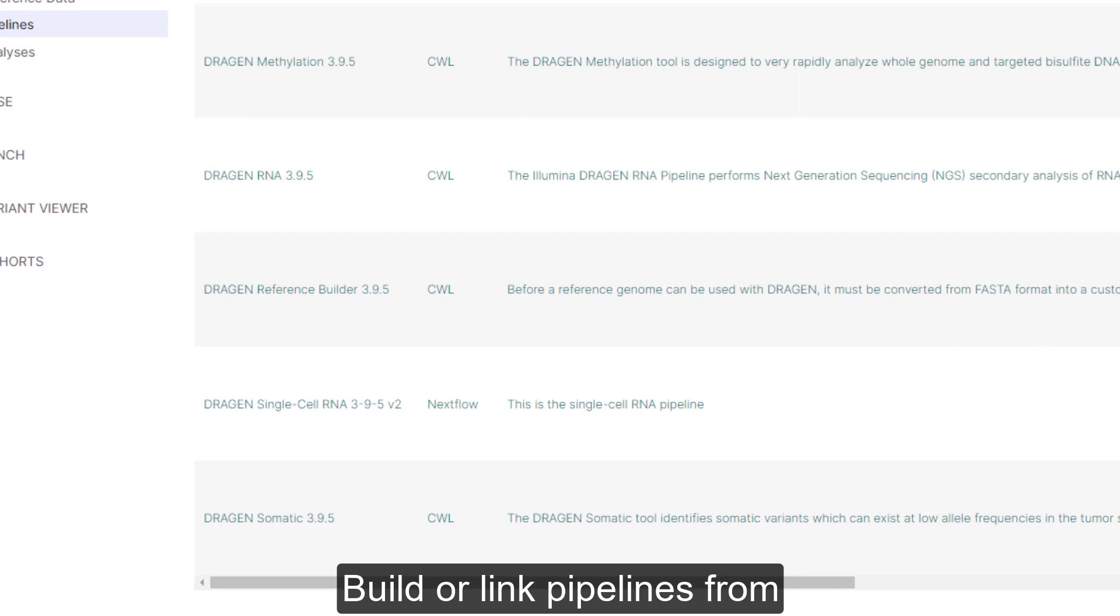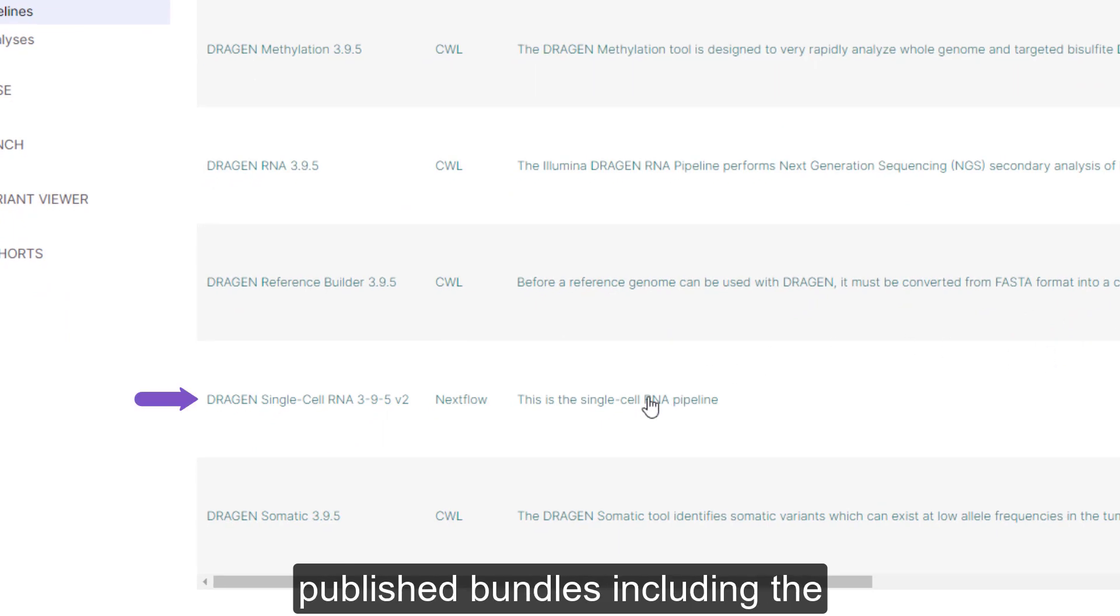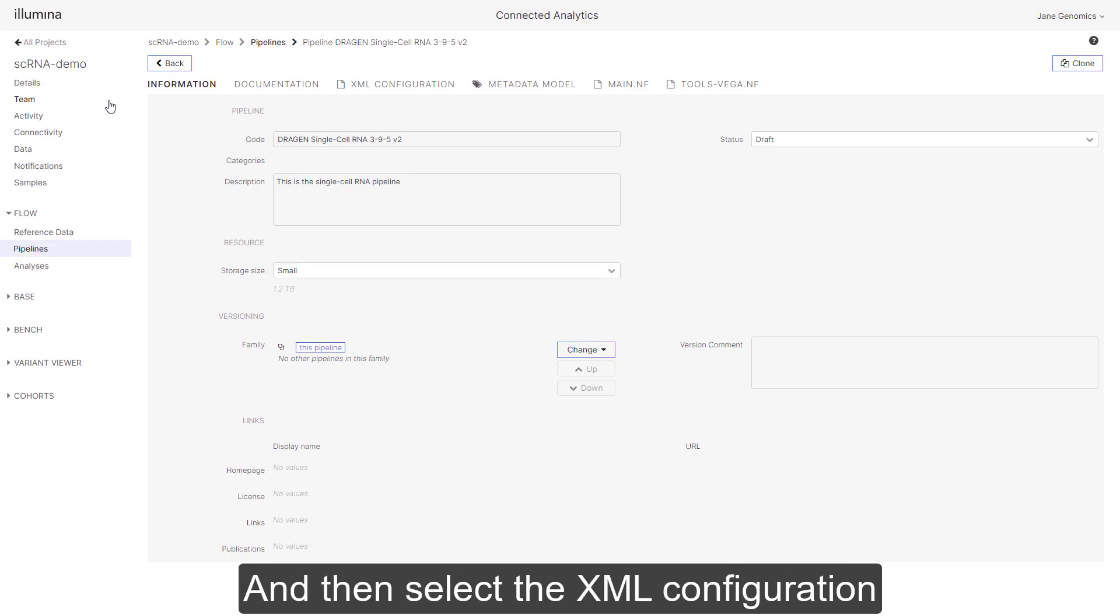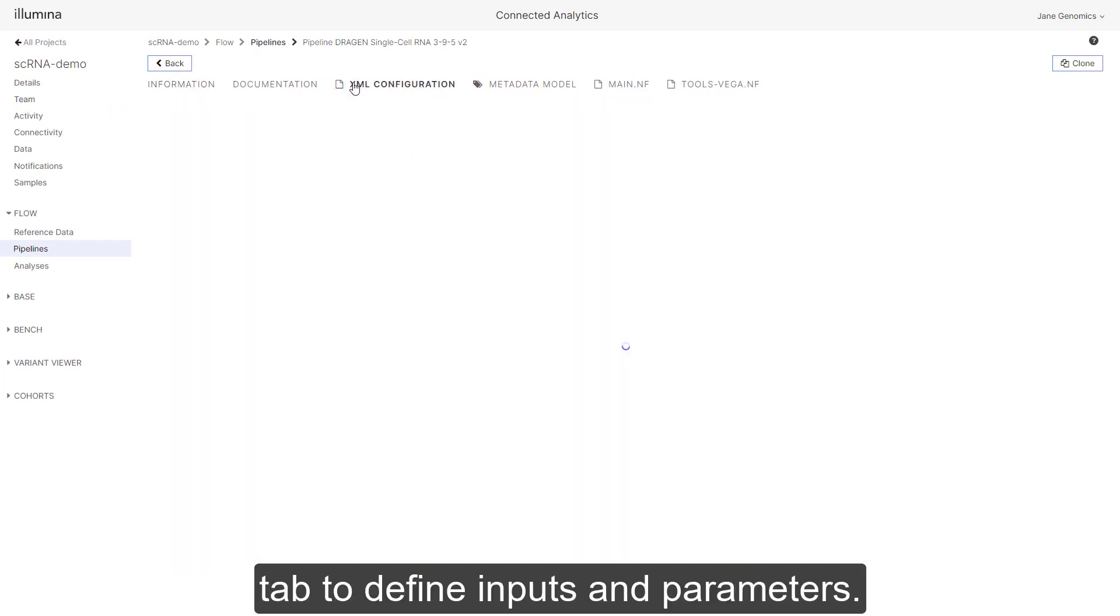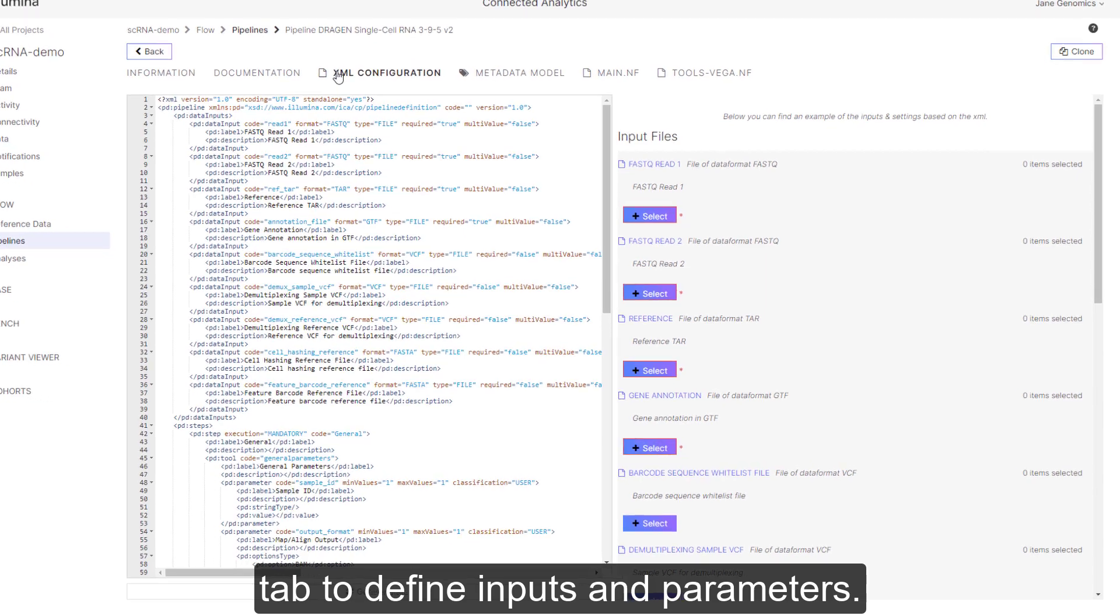Build or link pipelines from published bundles including the Dragon single cell RNA pipeline, and then select the XML configuration tab to define inputs and parameters.